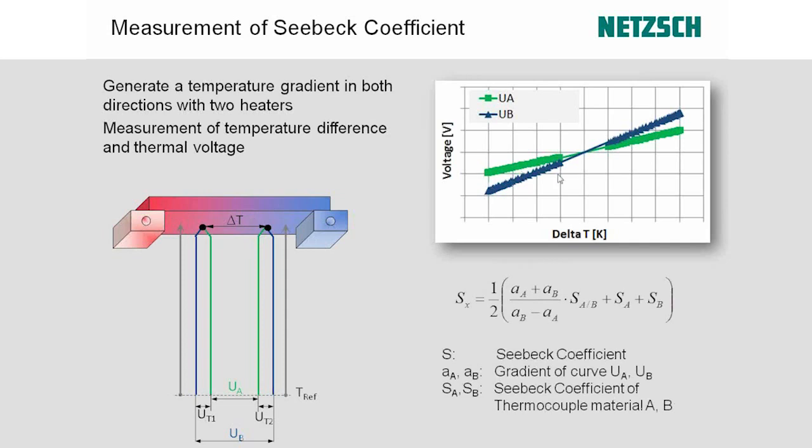So we have over 100 points here, which allows us to assure that we have a linear relationship. We'll see that this is part of our quality check. We'll have more on that coming up to really validate whether we've got the measurements set up correctly.